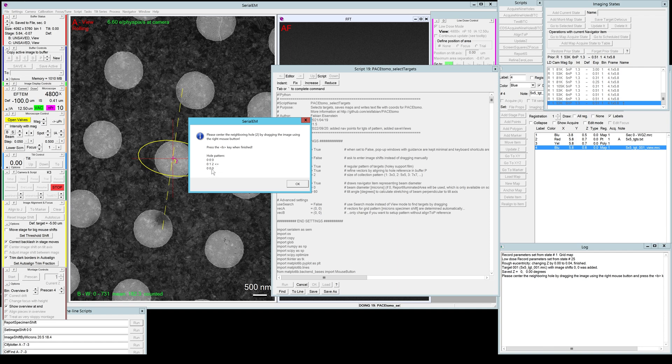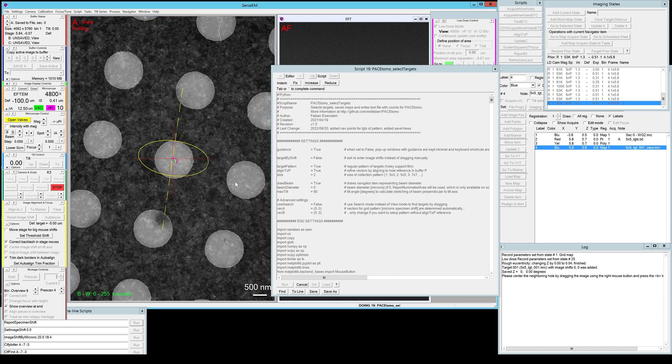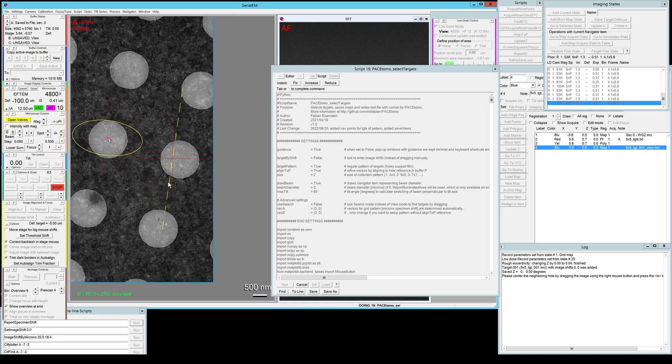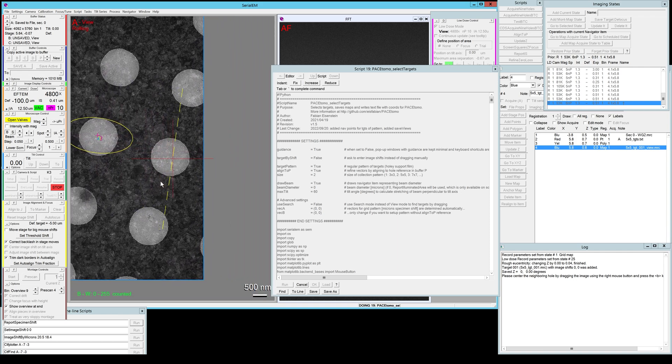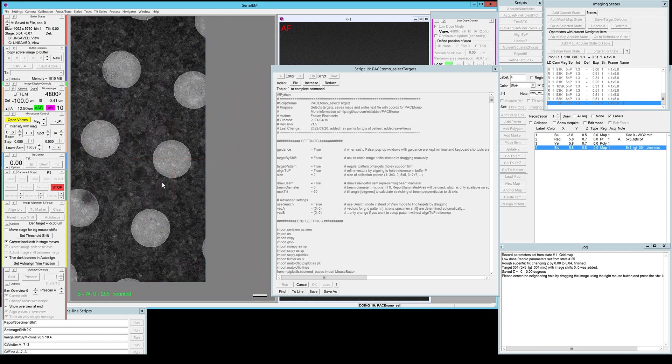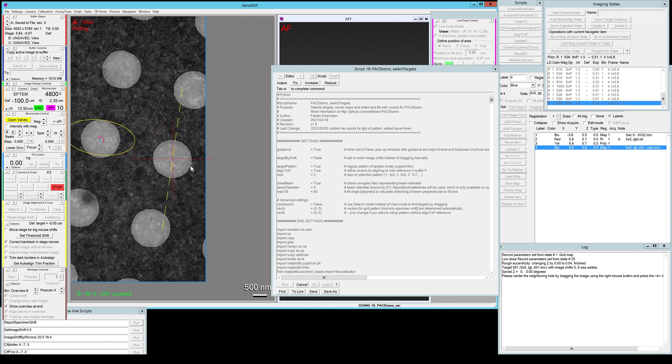We are centered on hole one right now and we want to drag it to hole number two which is this one in this case. This doesn't have to be super precise, just get it roughly there and then it will actually align it again to the reference to be more precise. So hit B when done and let's see what happens next.